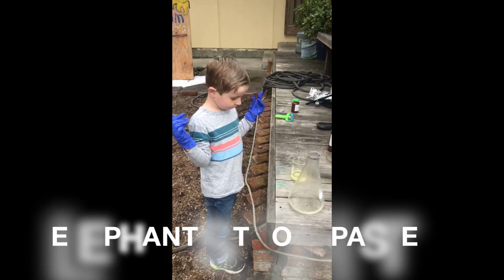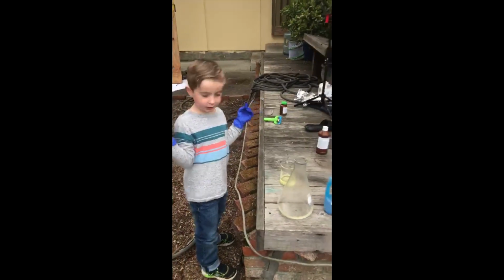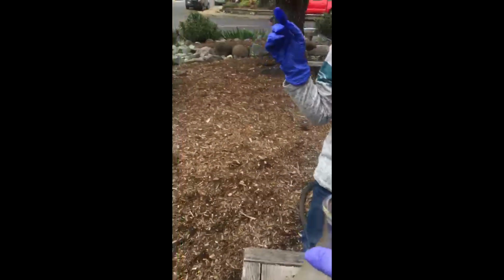Graham has his gloves on, and we are outside because it is cool. Elephant's toothpaste definitely is pretty messy. So here's what we did. In this bigger container, this bigger beaker, we did our hydrogen peroxide.